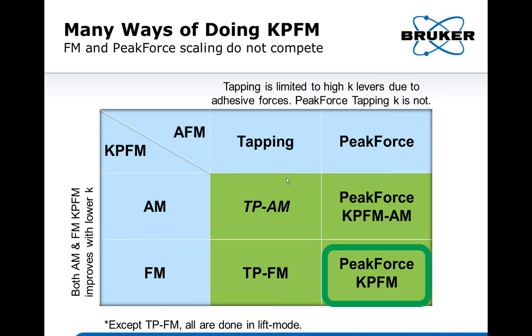For example, we can combine tapping mode with AM KPFM, abbreviated as TPAM, and this is actually the mode that has been there for a long time. And also you can combine tapping mode with frequency modulation KPFM. Now that we have this PeakForce tapping mode, we can do the similar combination: we can have PeakForce KPFM AM mode, and also we can have PeakForce KPFM frequency modulation mode.